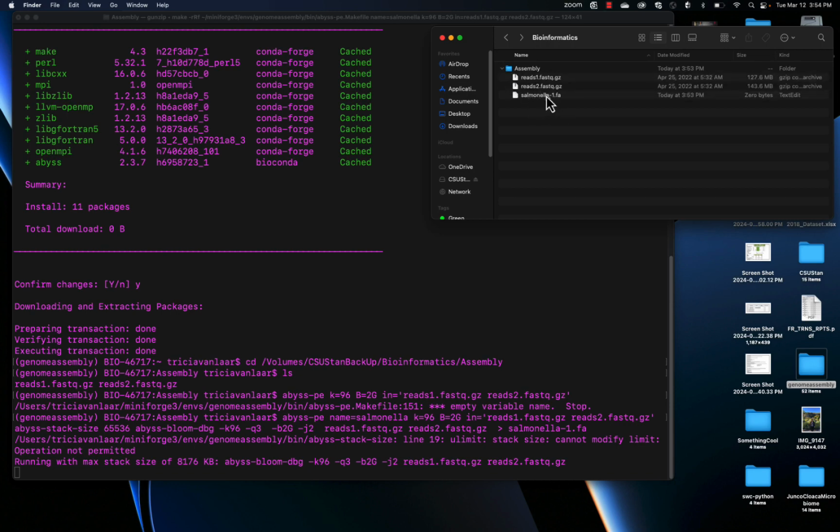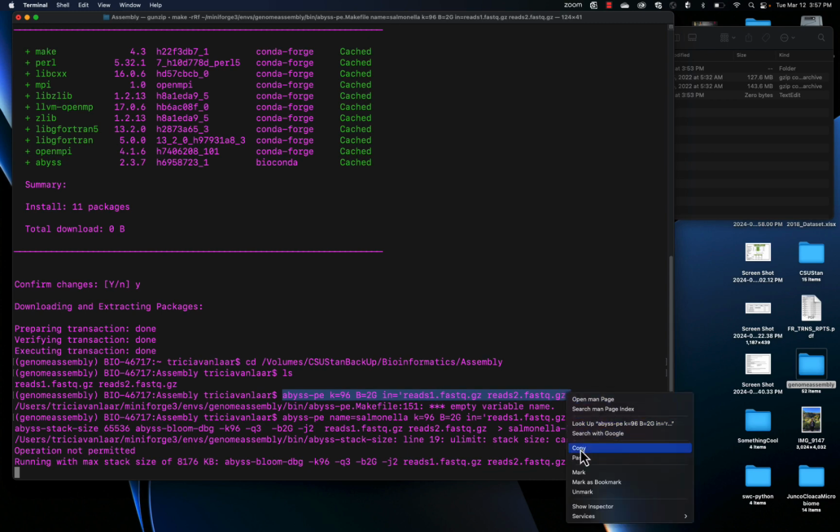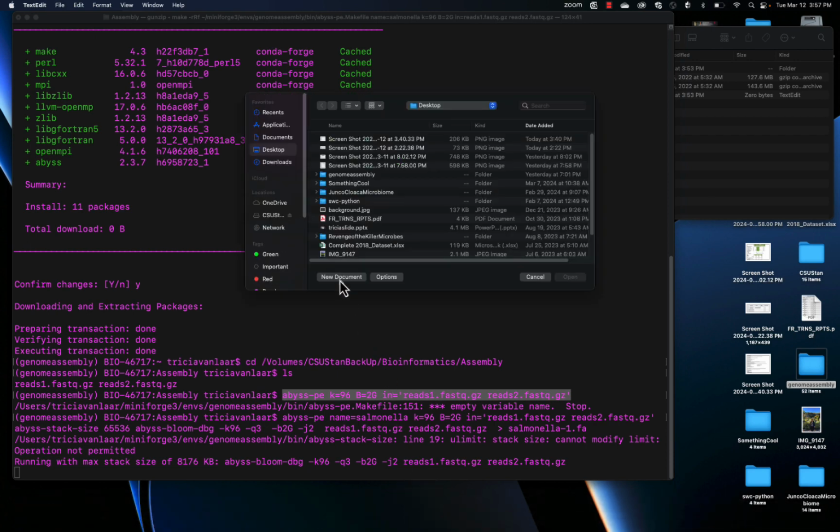So I'm going to go ahead and pause this and wait until it's finished, and then we'll see what the results look like. And I just thought of something: one thing that you can do while you are waiting for this to run is you can get things set up so that you could get it ready to upload to GitHub, so that we can showcase what you've done on GitHub.